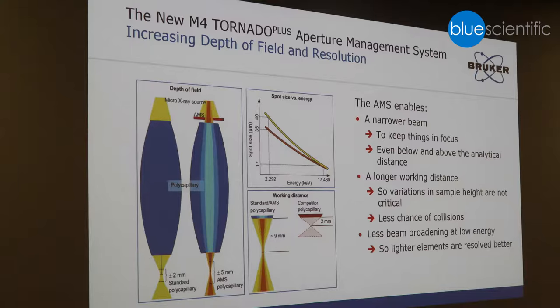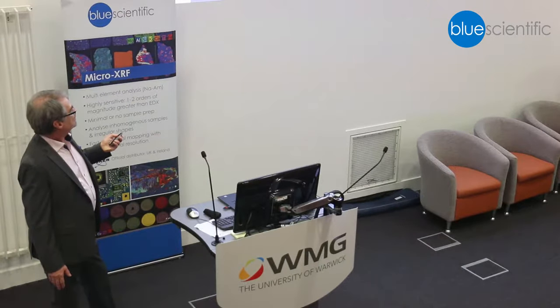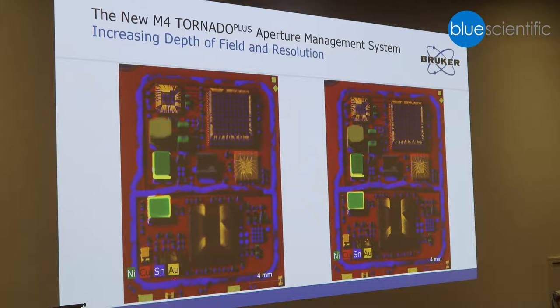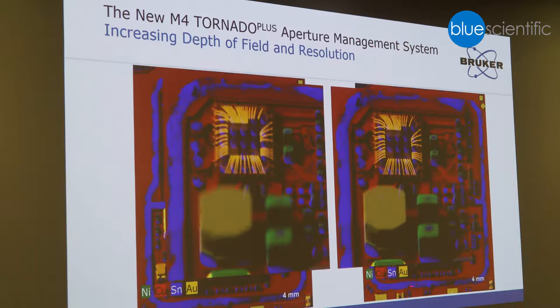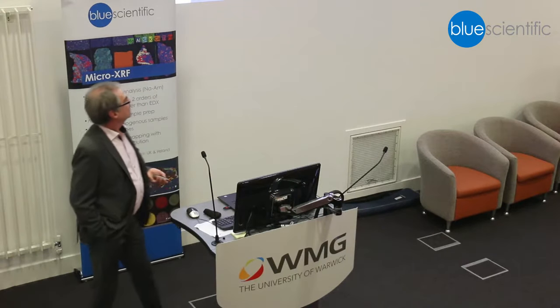The advantage is when you don't deal with flat samples but samples with a certain topology. Without this system, you get a variation in spot size which translates into a blurred image. With aperture management, you get a sharper image less dependent on the topology of your sample. Here is a practical example: a populated printed circuit board. The left side is with the standard configuration — rather blurry. The right side is with the aperture management, where you can clearly see the gold bonding wires inside the integrated circuit. It provides sharper images even with variation in height.